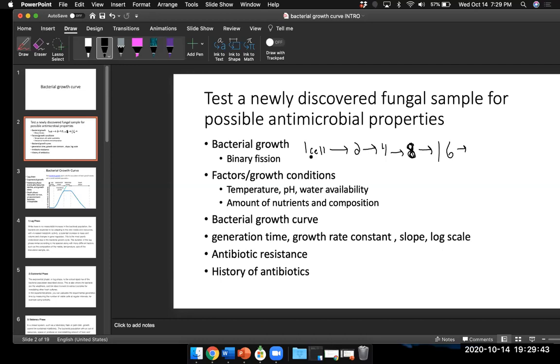And that's why plates, sometimes you can incubate for just 24 hours, but sometimes you need to incubate for 48 or even longer, because you have diluted down to just 1 cell, and you need to give enough time for enough divisions to happen, because you need to get in the hundreds of thousands, if not millions of cells, before you can get a colony that you could see with the naked eye.